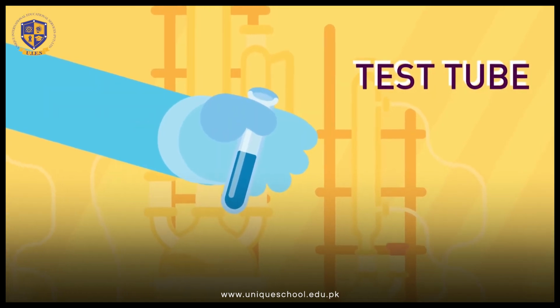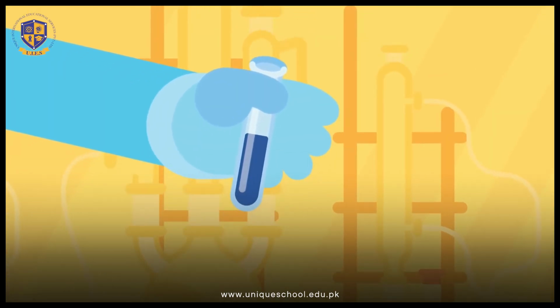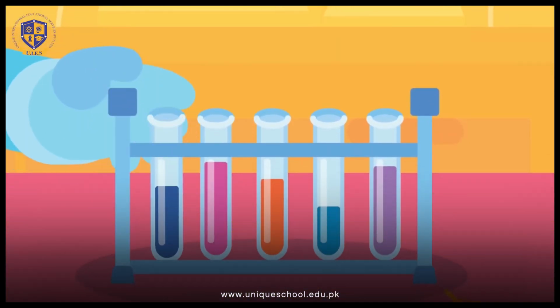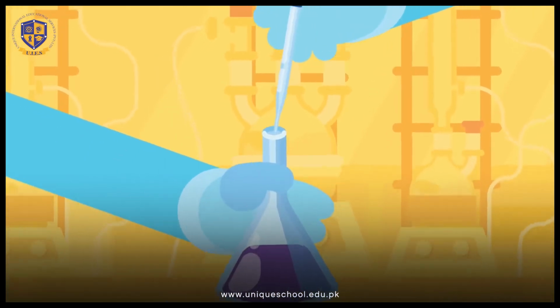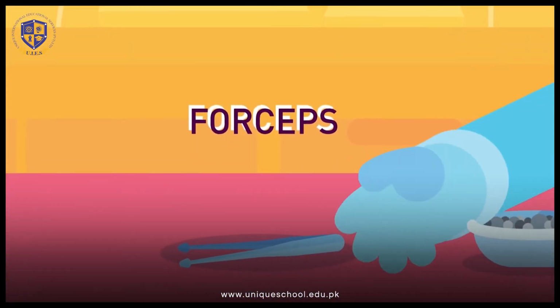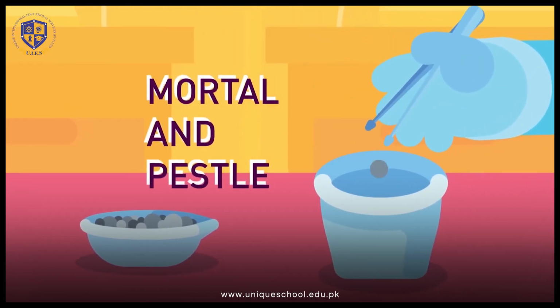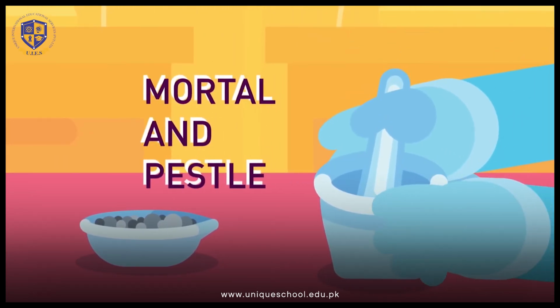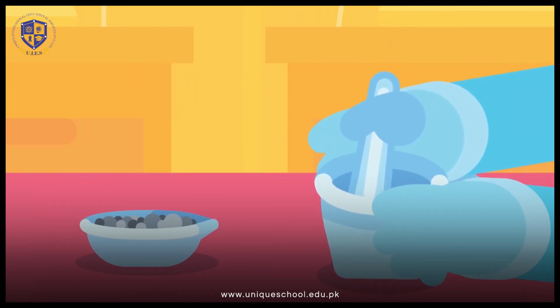Test tube. A glass tube with a round base used to hold and mix liquids. Needs a steel rack or a clamp to hold it. Pipette bulb. A round rubber bulb used to draw liquids into a pipette. Forceps. Used to pick up or hold small objects. Mortar and pestle. Used to crush and grind materials. You may have seen something similar in your kitchen.